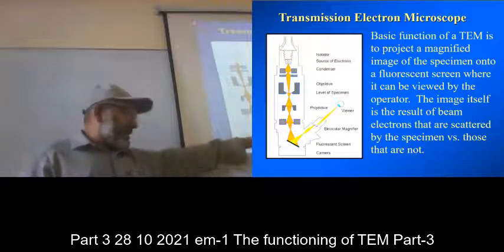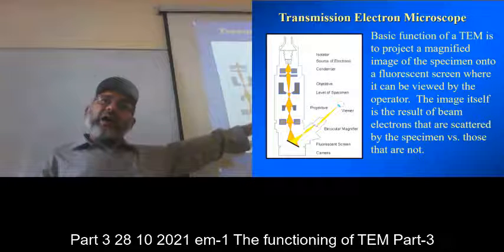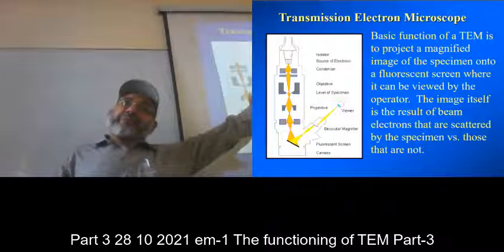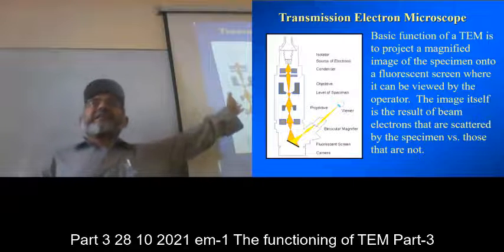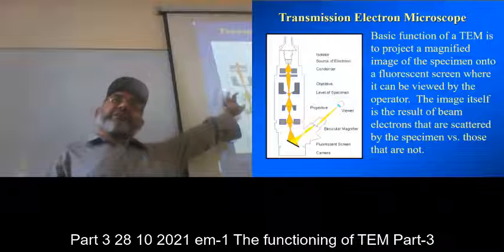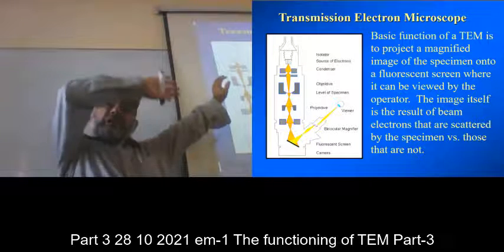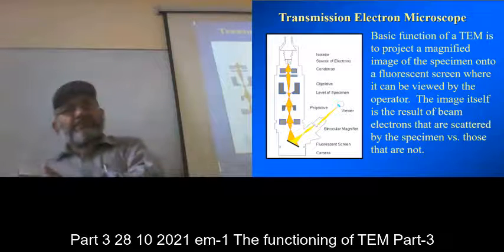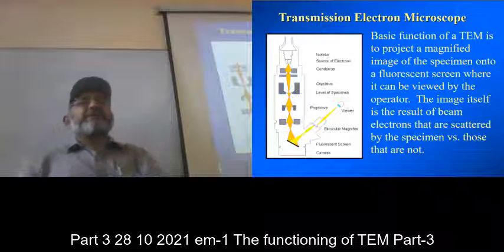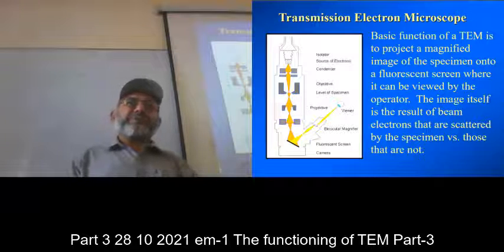So that is not technical and never advised. What is advised is a properly set camera through the manual, or the digital camera connected with the microscope. When I was looking for a CCD camera to be connected directly on top of the microscope, which translates the image onto the computer screen, its price in those days was about 40,000 pounds, right?